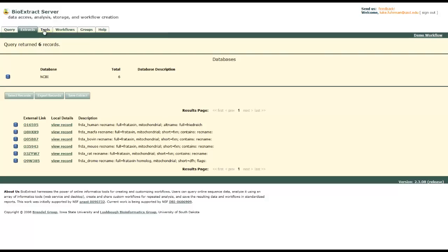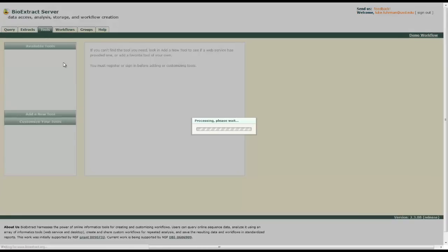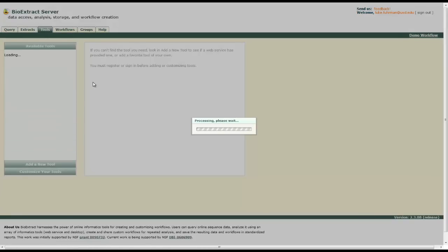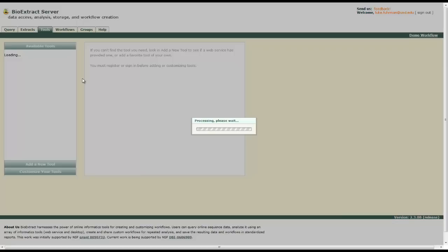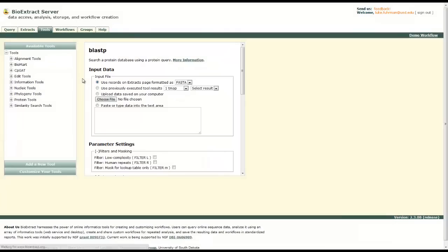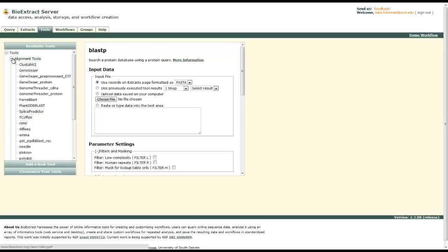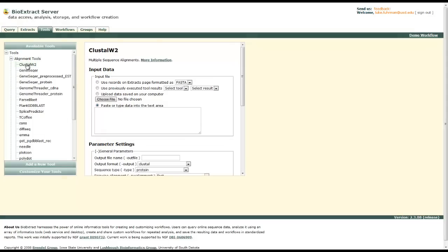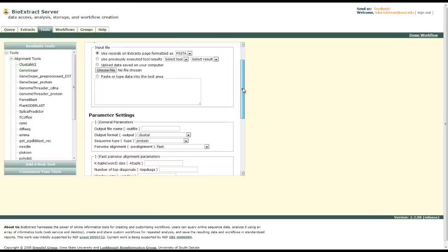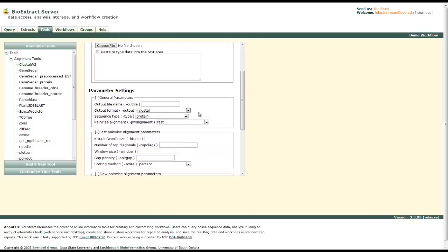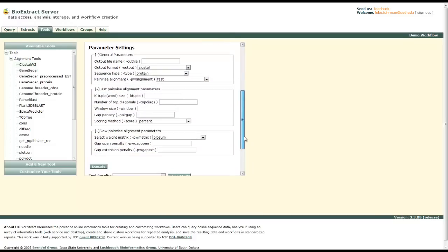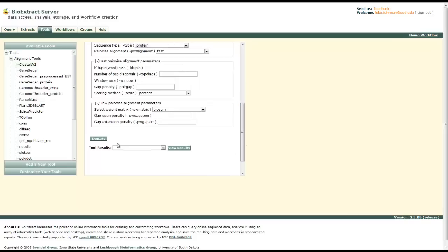Now we can align these sequences if we'd like. We'll go back to the tools section. Once it's done loading, we'll go to the alignment tools and select Clustal W. Use from extracts page FASTA format. Make sure that protein is selected there.